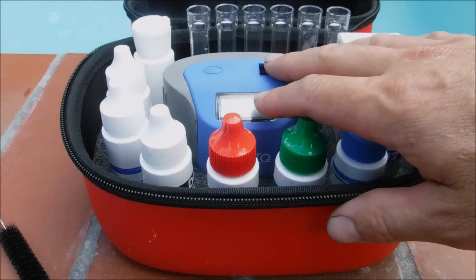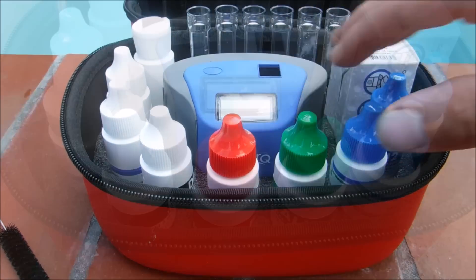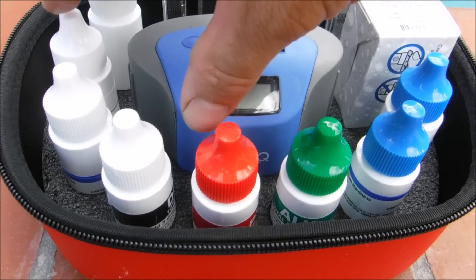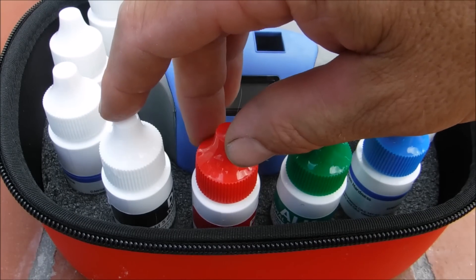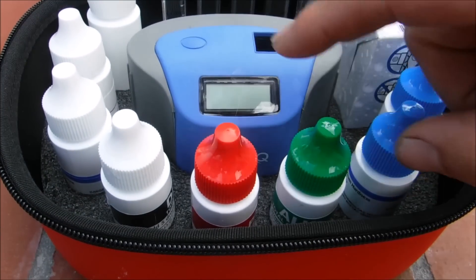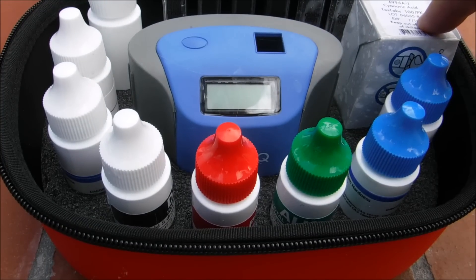The ColorQ Pro 7 is a hybrid test kit — you have reagents and also an electronic readout. This test kit uses DPD. It'll test for free chlorine, total chlorine, bromine, pH, alkalinity, calcium hardness, and also your cyanuric acid level in your pool.